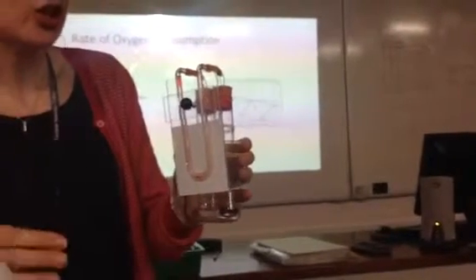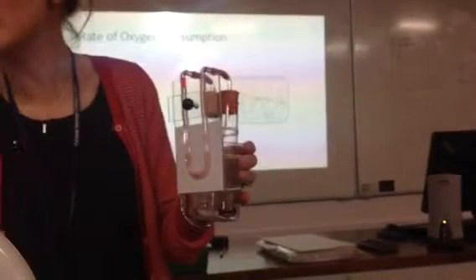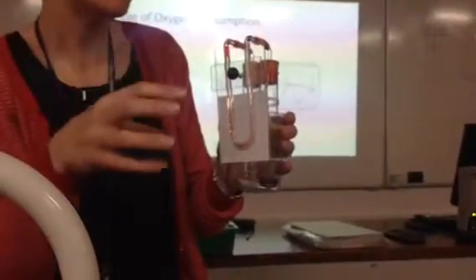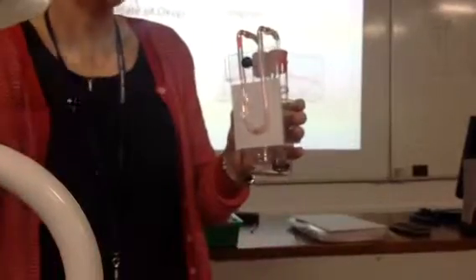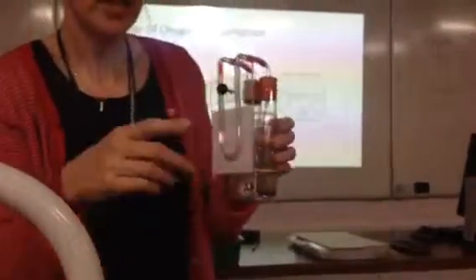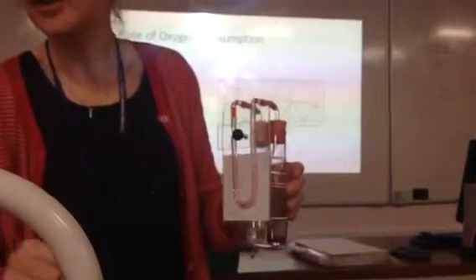It allows us to measure the oxygen consumption because the carbon dioxide is scavenged. Can you remember what it's scavenged by? The soda lime, very good. So that decreases the total volume of gases that are in the chamber. So if the chamber is closed, that means that as the trace continues, it goes down, and you can measure the start volume and the final volume to measure your oxygen consumption using a spirometer. Respirometers for organisms that don't ventilate, spirometer for organisms that ventilate using oxygen and air. Okay, thank you.